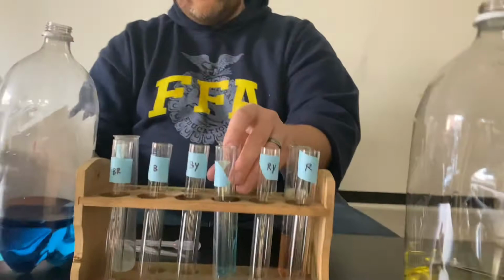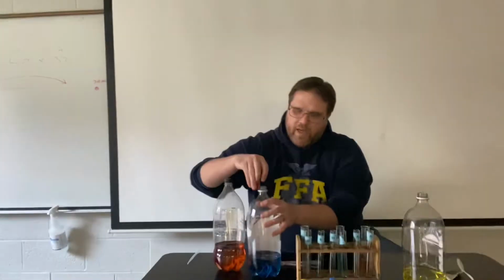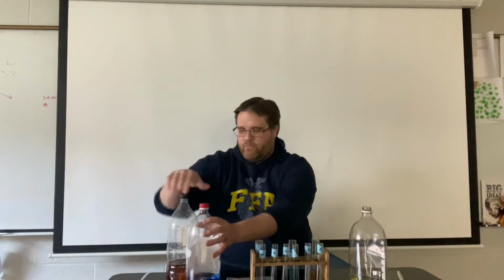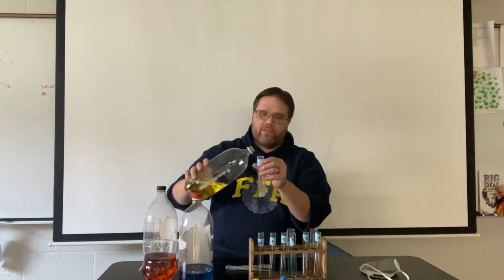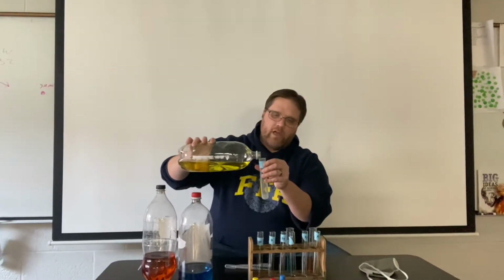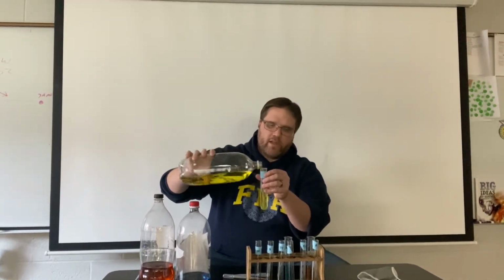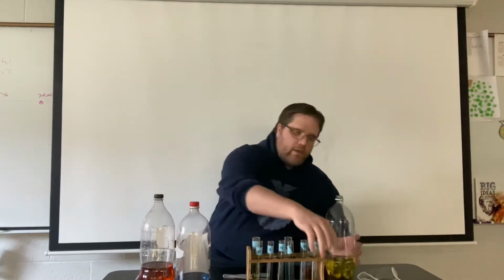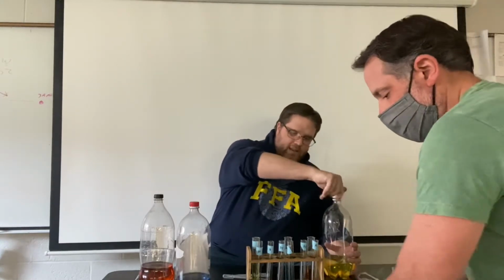Okay, so right now we're just filling these up. Always seal off the bottles, because you never know if you're going to spill something or put it everywhere. And take your time. Now, sometimes we would use a funnel to help us properly pour it in without having a lot of air or possibility of causing a problem. But today I'm just going to do it by hand. So here's what we've got. We have blue, red, and yellow.